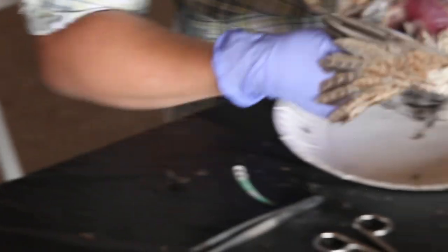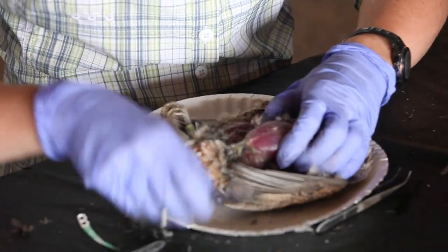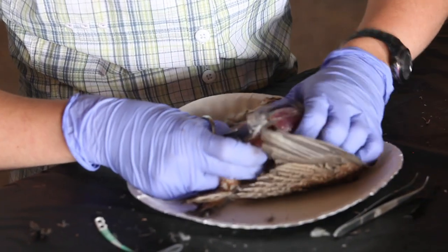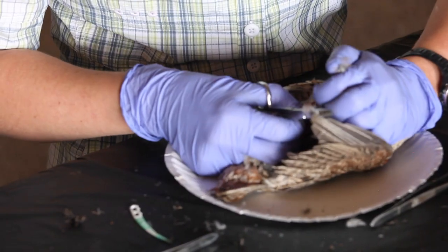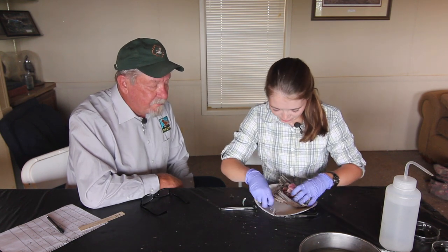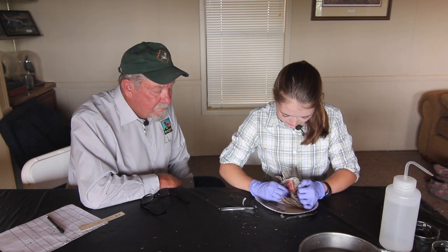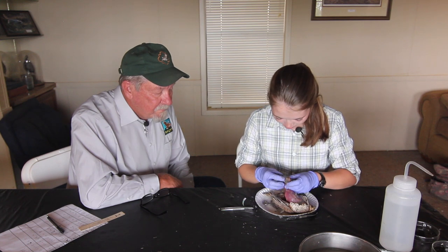So, nice, well-developed breast muscle. That's the other leg. And you can just get to it. Open, go into the body cavity. If you're a quail hunter, this would be what you're doing when you're breasting the quail. Just putting your thumb down underneath the sternum, the breastbone, pulling that up to where you're exposing the GI tract. It's a little bit frozen, but the technique's the same. Just got to pull that out. There's the internal organs, the viscera.